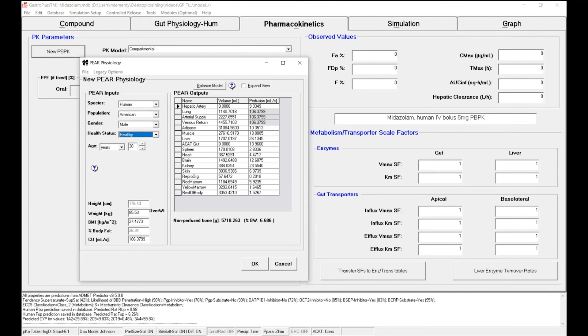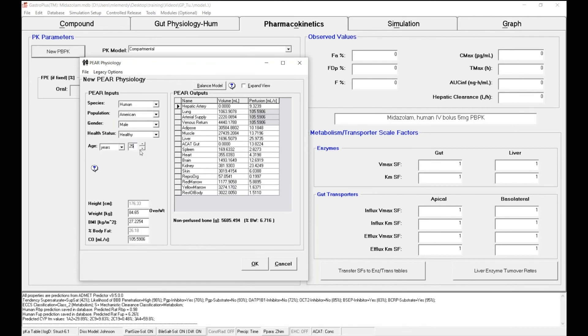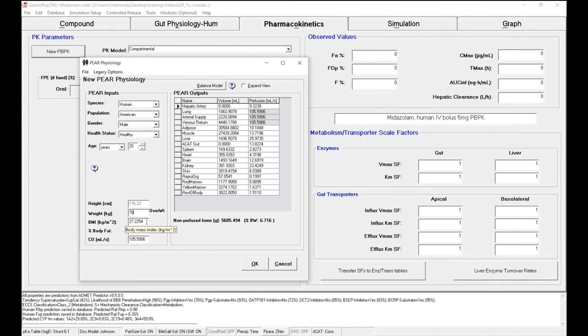These subjects are 25 years old, and you can see that as I'm changing my age, the tissue volume and the tissue perfusion flows are changing. And the body weight of those subjects is 70 kilograms. And I can click on another box to save this information.